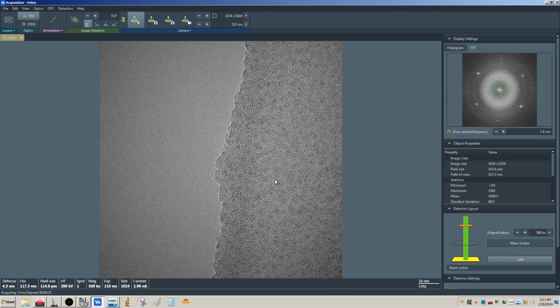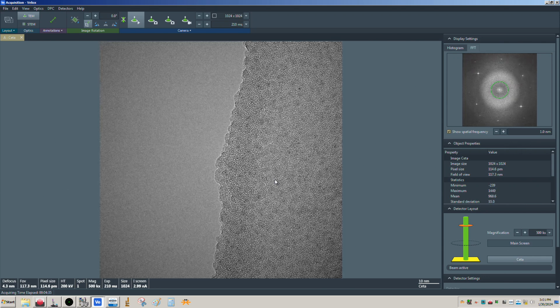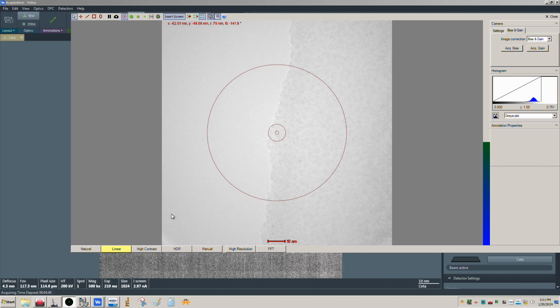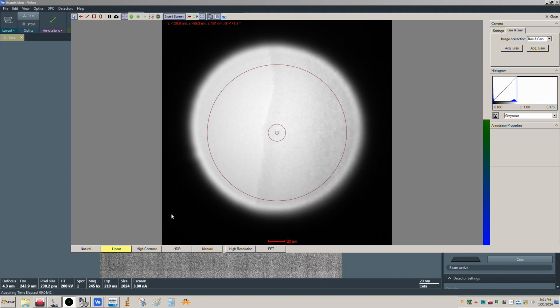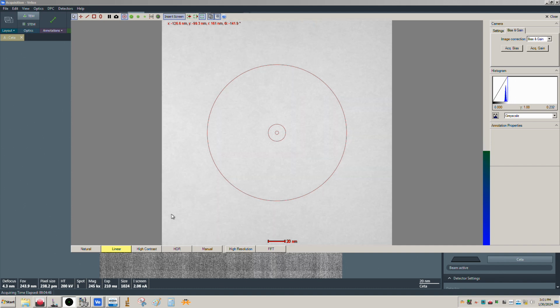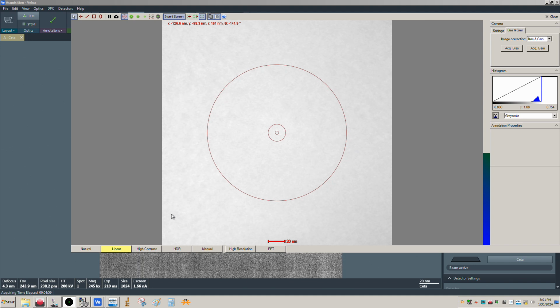So now if we drag over, we can use that as our starting point here. So let me mag out here. We'll drag over into the middle here. We're not going to be able to find the exact same place, but we don't need to for what we need to demonstrate. Okay, it's getting a little thick in there. This should work fine.